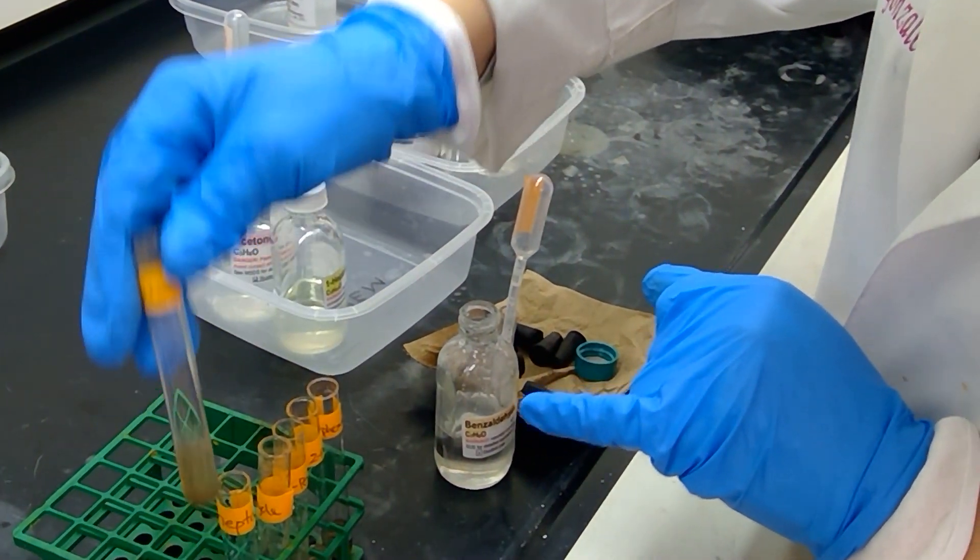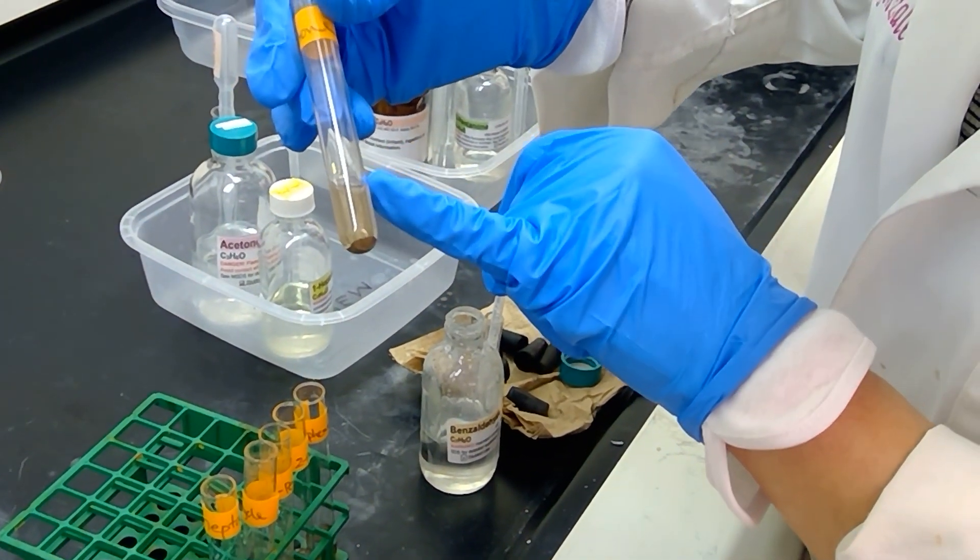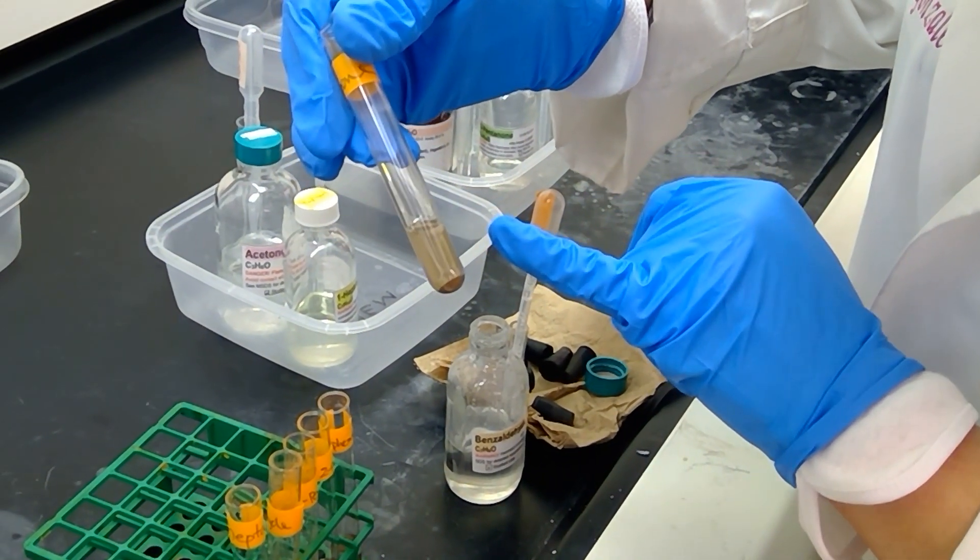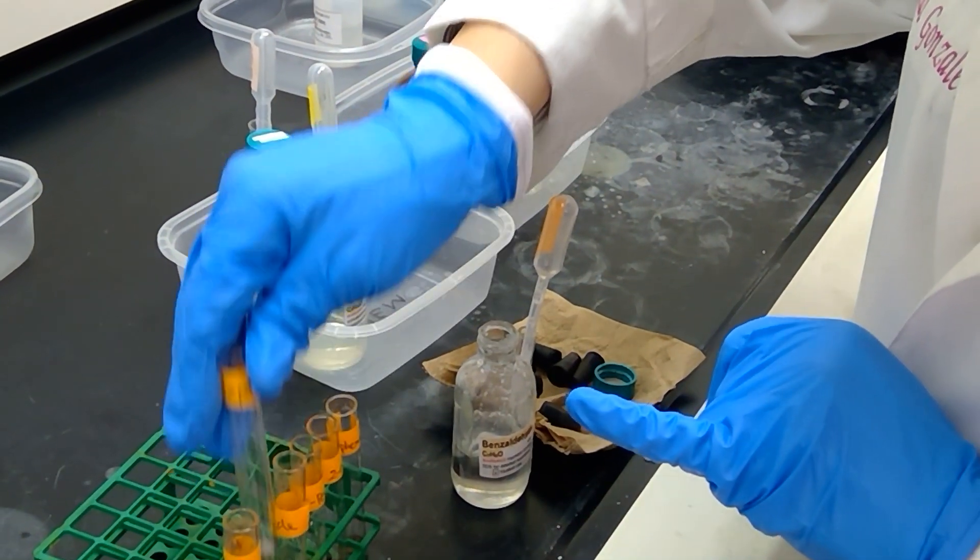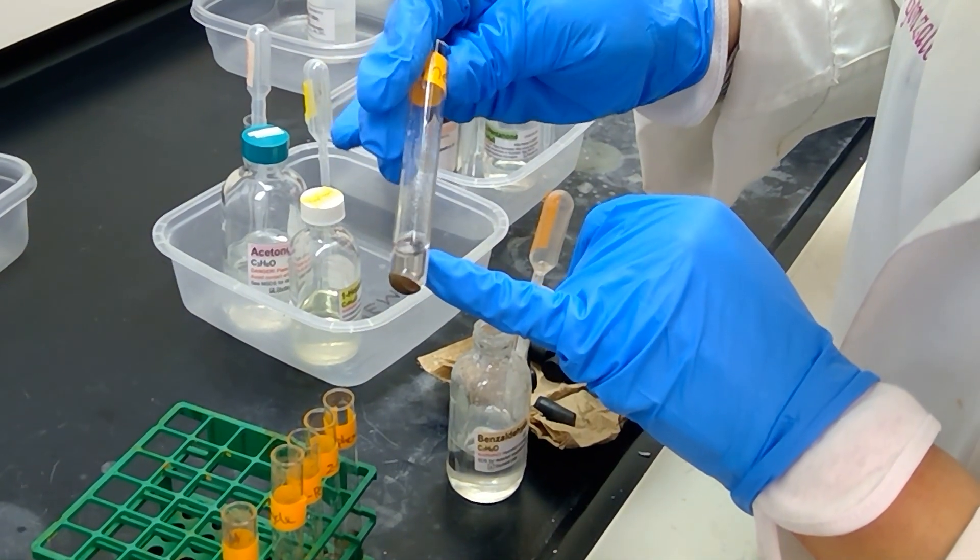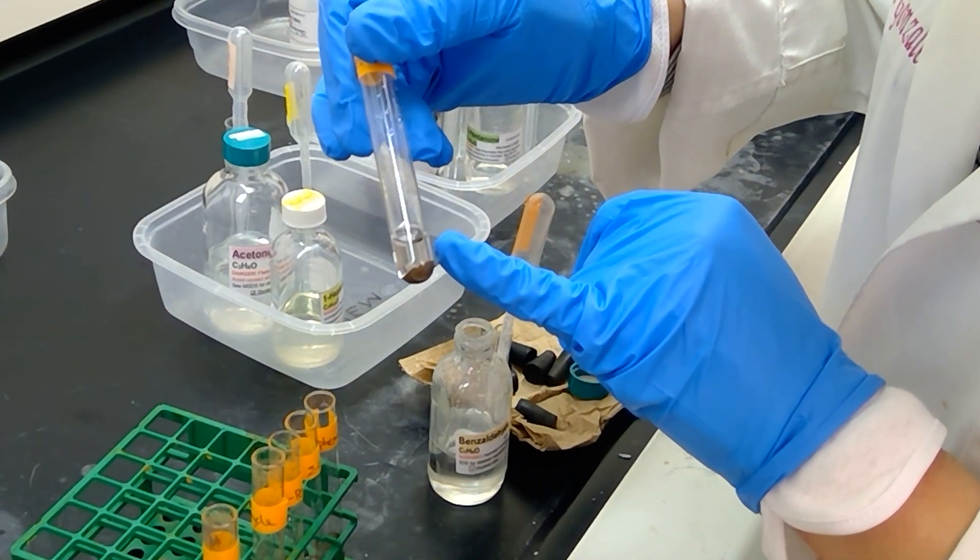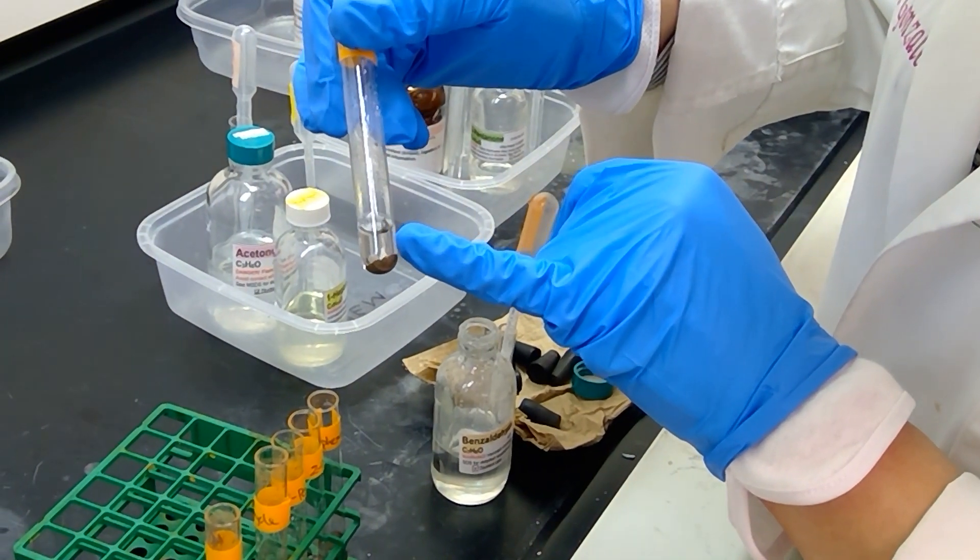Just to go back to our ketone, acetone, we definitely do not see any of that precipitation occurring in this test tube. Our heptanal is definitely much more precipitated, and on the sides of the test tube, you can see it does look somewhat silvery.